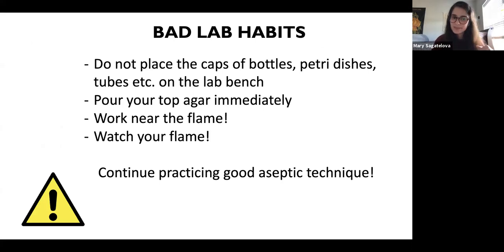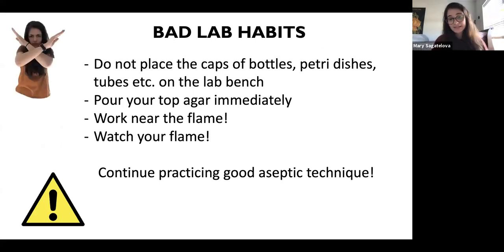And then let's get rid of some of these bad habits. Again, you guys did a fantastic job last week in terms of being better with our aseptic technique, but just some reminders. So we're always keeping this in the back of our mind. Make sure you're not placing the caps of any bottles, so like the top agar bottle, Petri dish lids, tube caps, anything on your lab bench, right? Again, that is a lot of bacteria around it, leads to contamination. We did see quite a bit of contamination last week, so probably because of these bad aseptic technique habits.